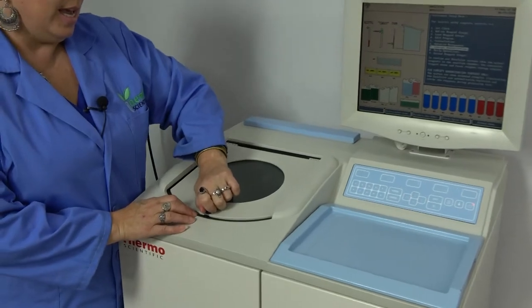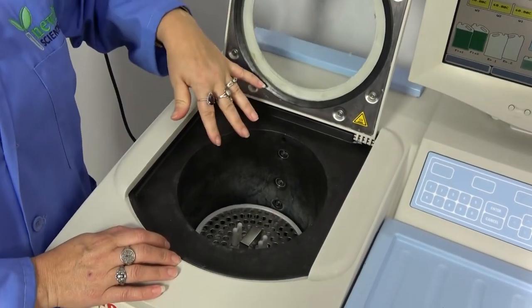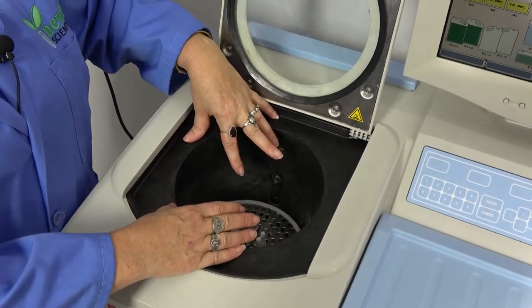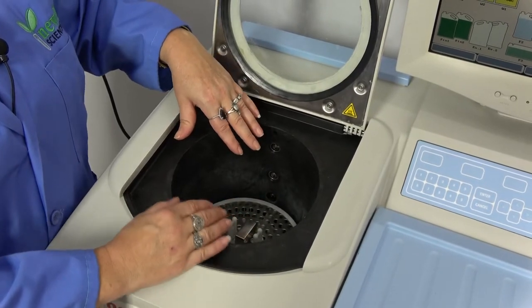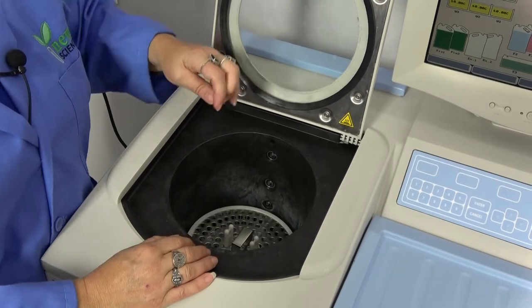The big difference is this chamber right here. The reaction chamber has its own exhaust fan which sucks down the fumes of the various chemicals involved in tissue processing and gets that away from the user's face so that you don't inhale as much.